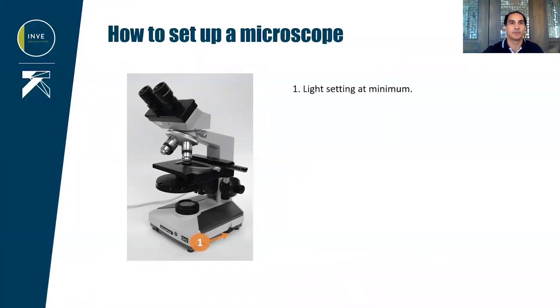First, before turning on the microscope, make sure that the light setting is at minimum. Then check that the eyepieces are clean, free of grease, fingerprints or dust, and clean them if necessary.